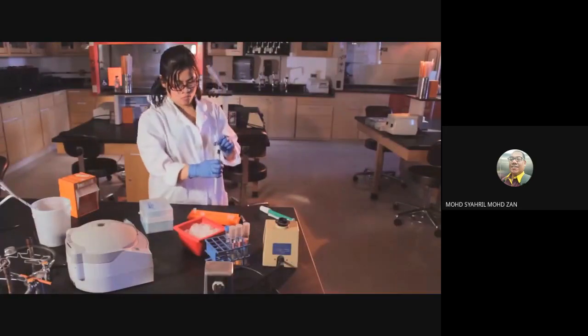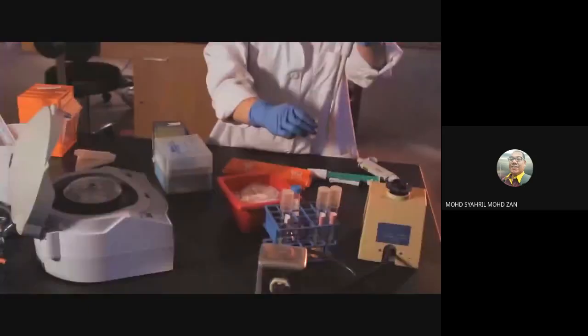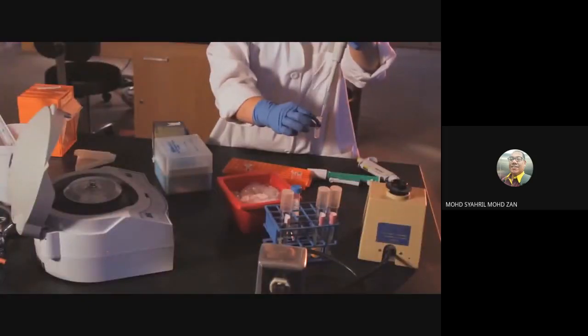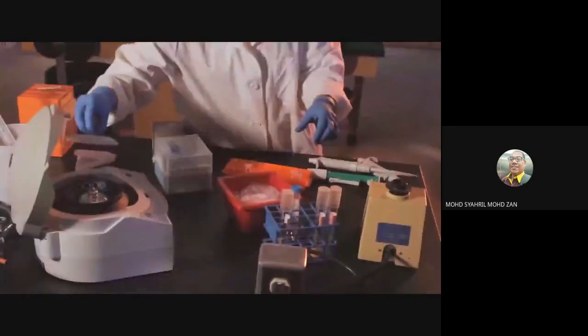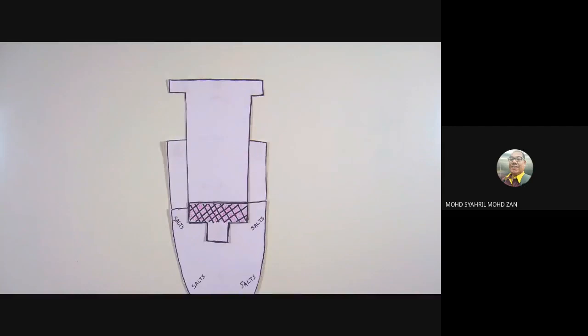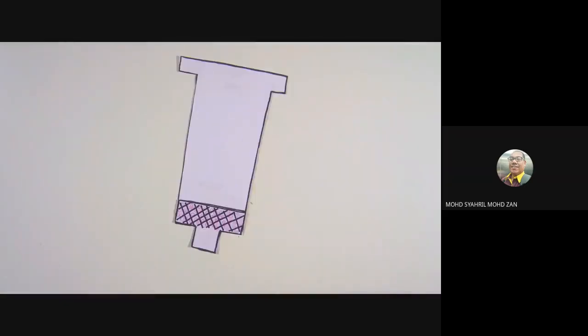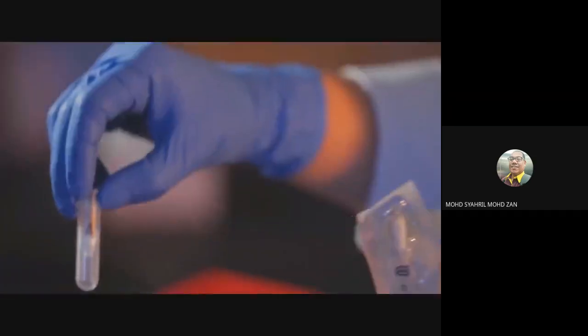To remove the salts left over from the buffer, wash the spin column by adding 750 microliters of wash buffer, which contains approximately 70% ethanol. The salts are soluble in 70% ethanol, but the DNA is insoluble. Centrifuge for 1 minute. The insoluble plasmid DNA remains bound to the silica membrane, while the flow-through carries away the salt. Discard the flow-through.